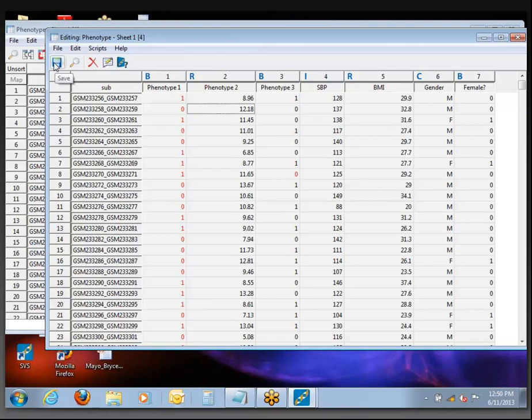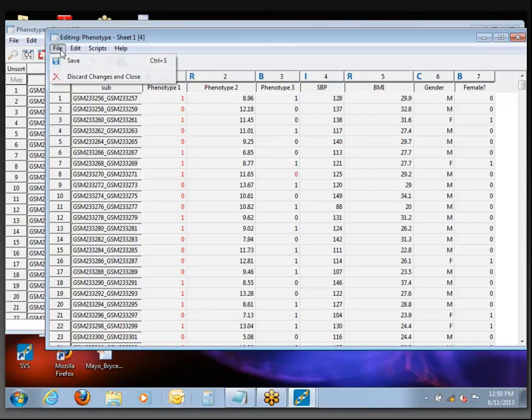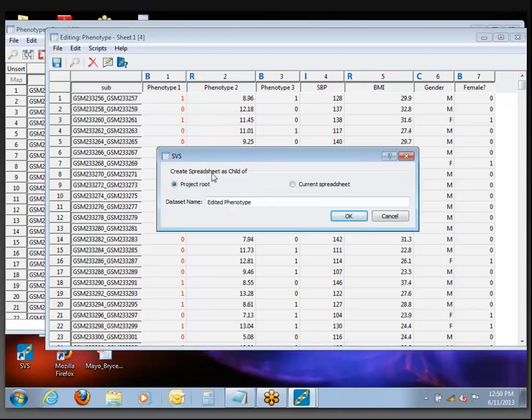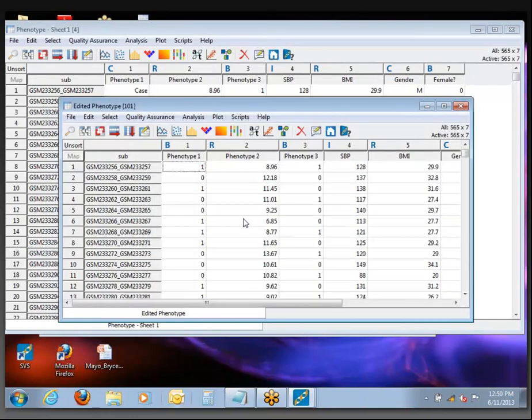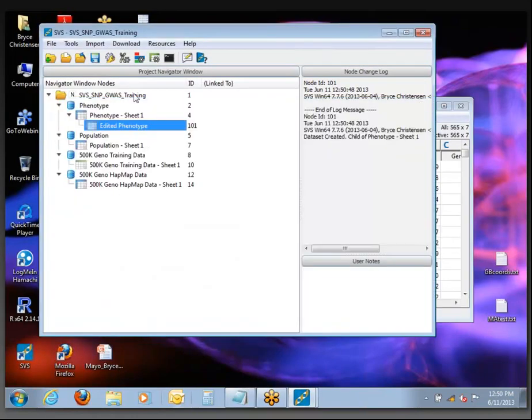Once you have made all the changes you want to make, you can click this little blue save button — also in the File menu, Save. You see the choice to create the new edited spreadsheet either as a group-level node or as a child of the current spreadsheet. Let's keep it under the current spreadsheet and click OK. Looking now at the project navigator, you can see it created this new spreadsheet as a child node.